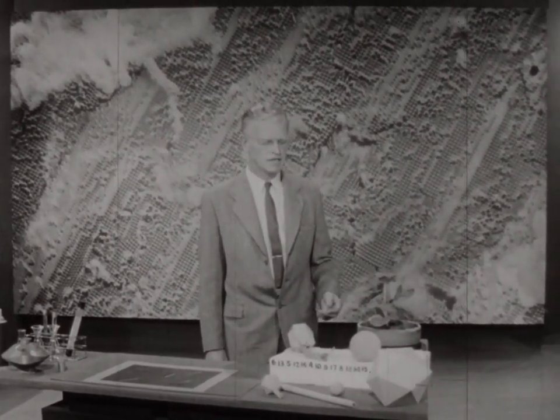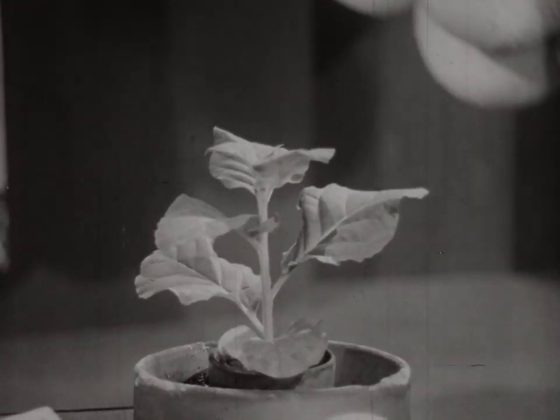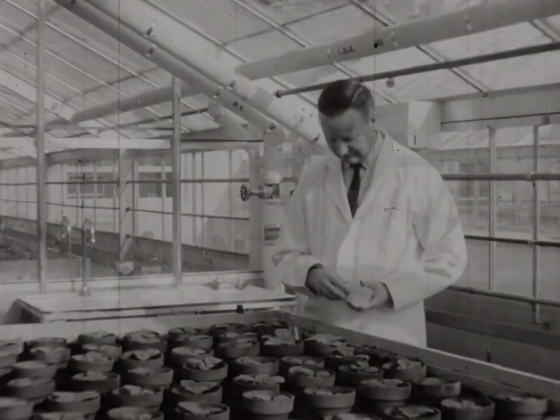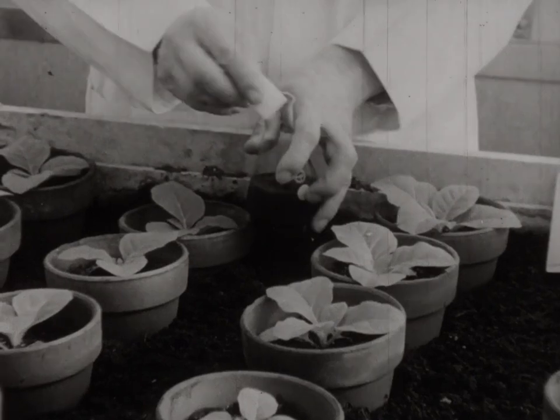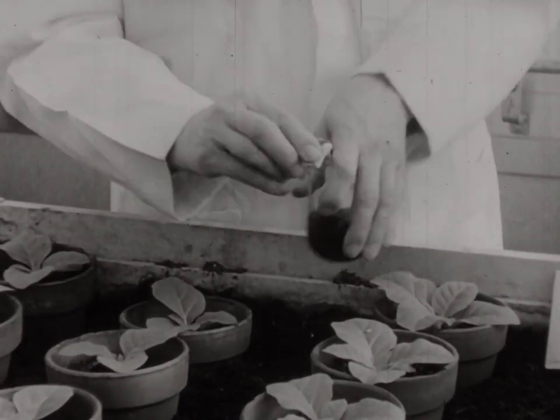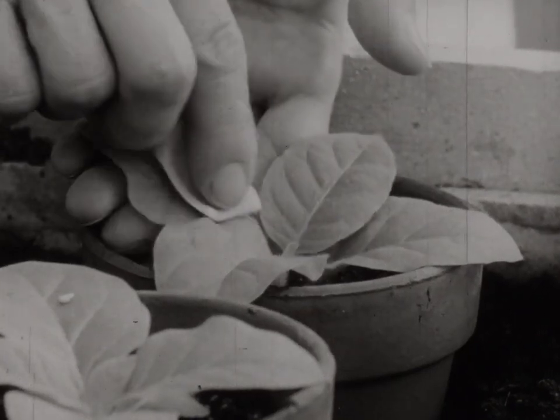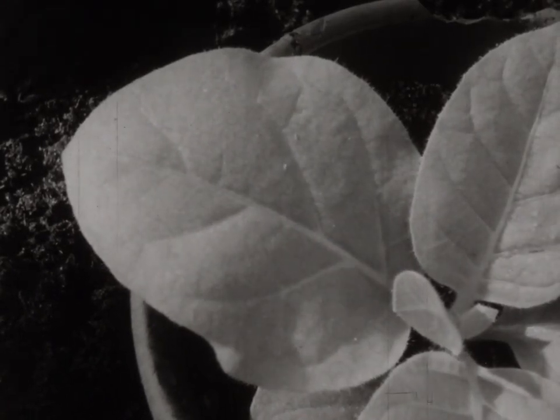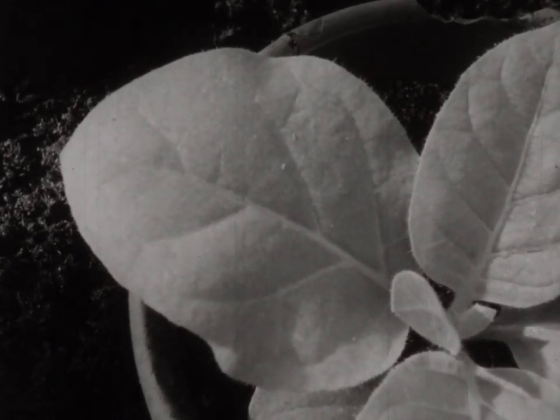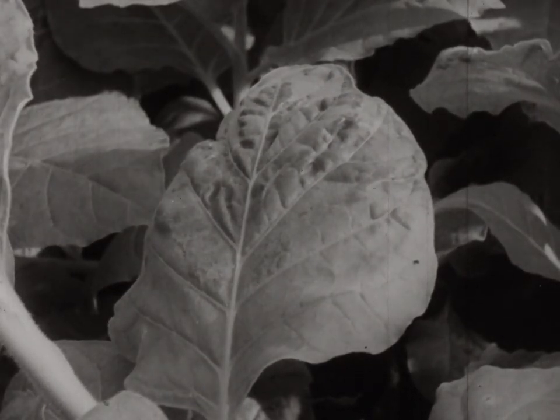So we're going to consider how we purify viruses, in this case, tobacco mosaic virus, which might be infected into a tobacco plant like that. And we have to go to the greenhouse. If we go to the greenhouse, we find that we can take tobacco mosaic virus with a little carborundum and rub the material on the leaves of small plants. And we rub each leaf, and then we wait about 2 weeks, and we find that the plants have grown and that the plants have now become infected and mottled.